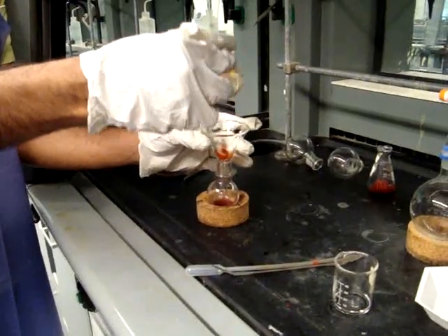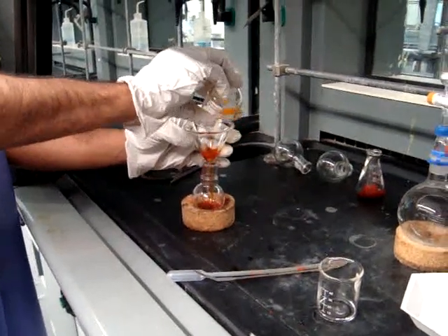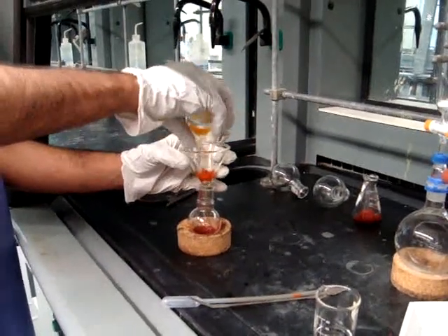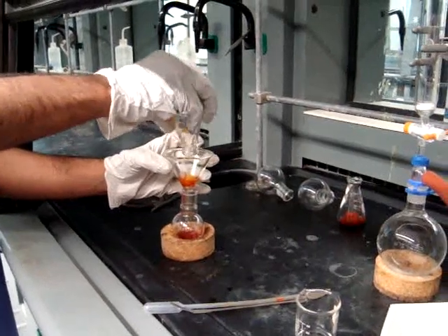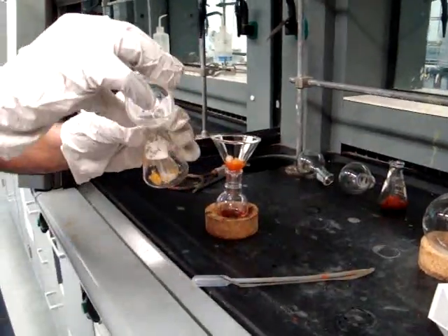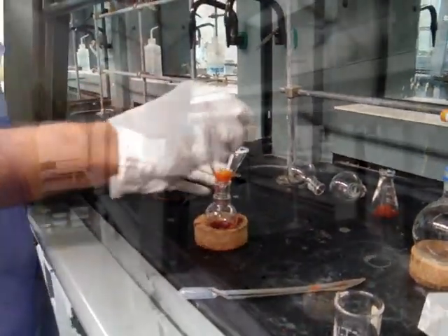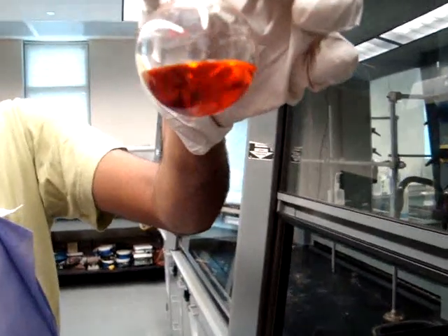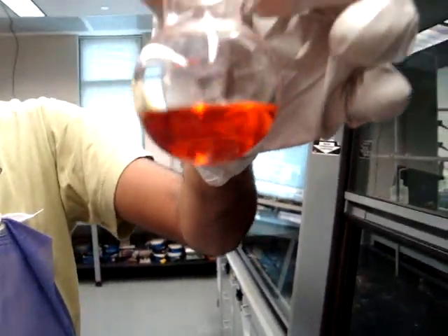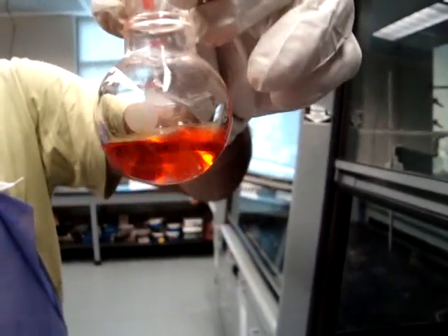Add more dichloromethane to the flask to get the remnants of the paste of the solution and pour into the filter. You may have to do this a couple times to make sure that the flask is empty. The solution is now clear because the sodium sulfate dried the organic solvent.